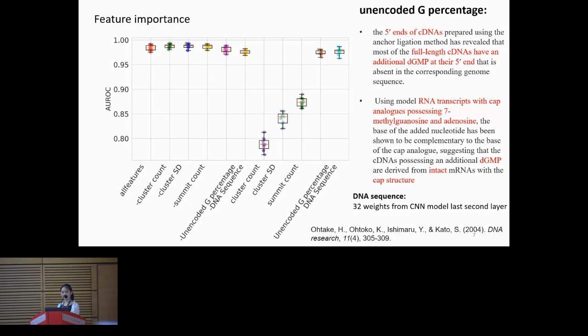And the correct TSS is very important, for example, for CRISPRi screening or stuff like this. So it's very important to know exactly what the TSS in particular is. When you compare your CamoTSS performance versus, let's say, annotation in the FANTOM5 database, what is the percentage of overlapping TSSs you observe?